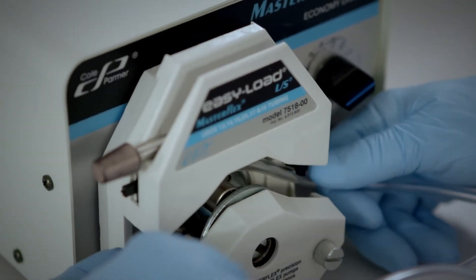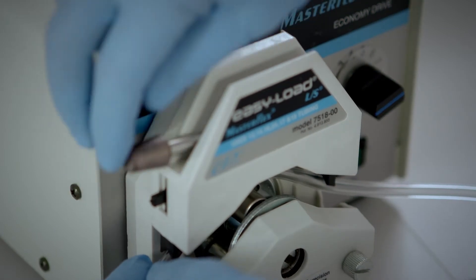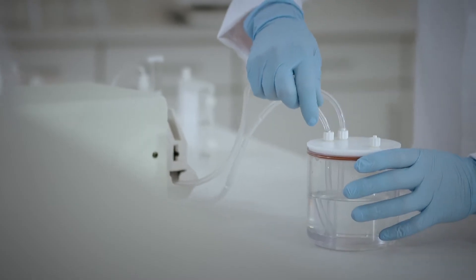Next, connect the inlet tubing to the VivaFlow 50R cassette and thread the tubing in the pump head. Then also attach the end of the tubing to the diafiltration reservoir.